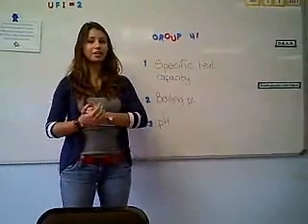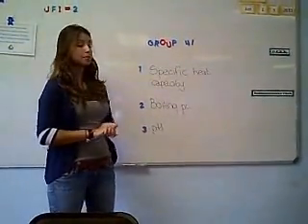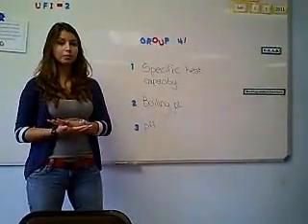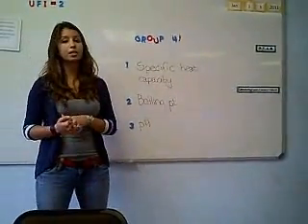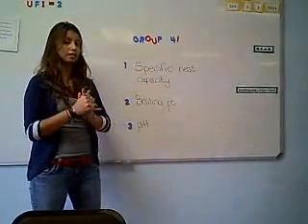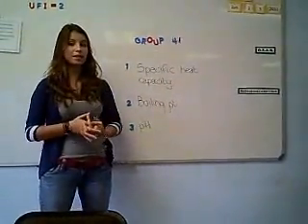From the American International School, Johannesburg, Jeff and I are doing the South Africa tap water part of the project. When we were doing the project, we looked at the specific heat capacity, boiling point, and the pH level of the water, and then we're going to compare that to the group that did the water in Norway. Now Jeff will be first explaining the specific heat capacity.